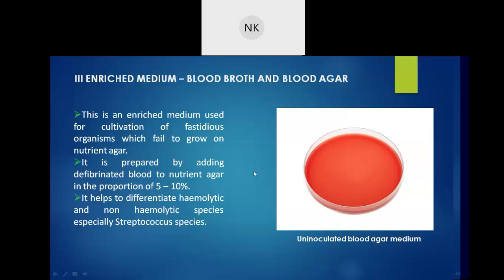It has to be defibrinated. Defibrination means the blood does not contain fibrin; that is where fibrin is being removed.